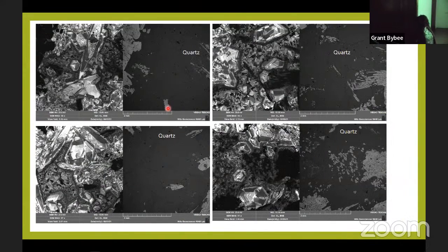Okay, so we have these cool ones, they don't show nicely here, but they're very nice. So here Leo was actually doing the CL images of quartz. You can see here your quartz is just one grain. They're meant to do a CL image, beautiful zoning of different quartz grains. Very, very nice. So you can see the growth of quartz, different, yeah.